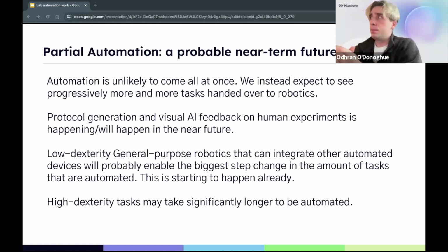Probably the next biggest low-hanging fruit is successful use of general purpose robotics to integrate different lab devices. These are the coarse-grained ones, things like your liquid handlers, your plate readers, maybe even your fridges if you're lucky. But things which don't require high dexterity movements, this is kind of the next step of automation, and hopefully we can move more and more things into this automated paradigm.